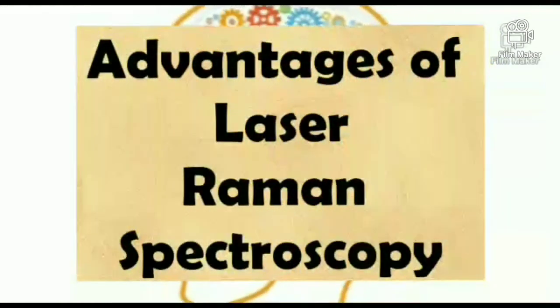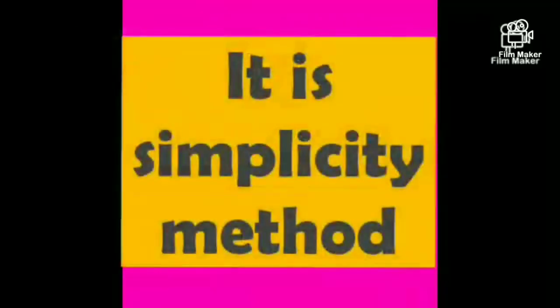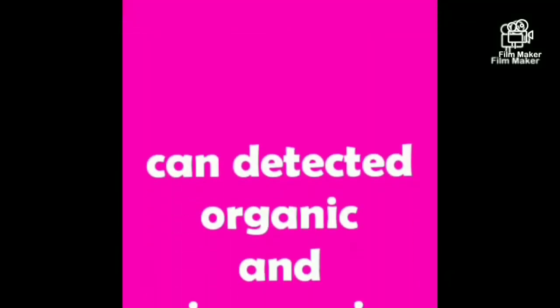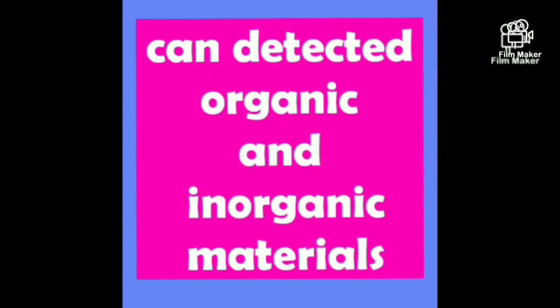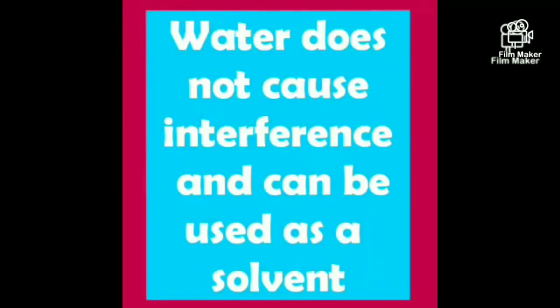Advantages of laser Raman spectroscopy. It is a simple method. Laser Raman can detect organic and inorganic materials. Limited or no sample preparation is needed. Next, water does not cause interference and can be used as a solvent.